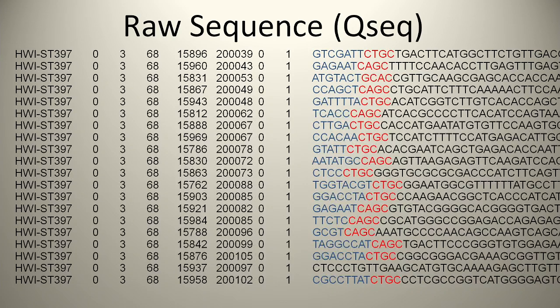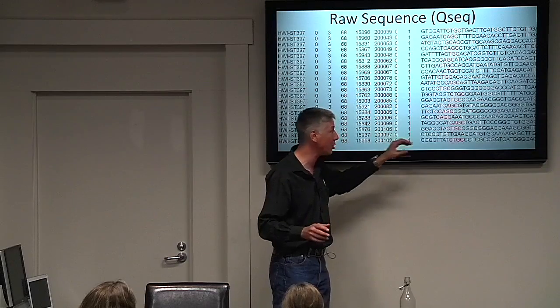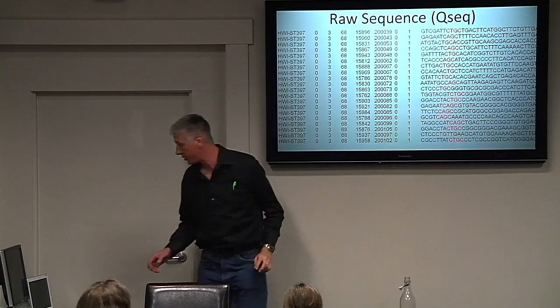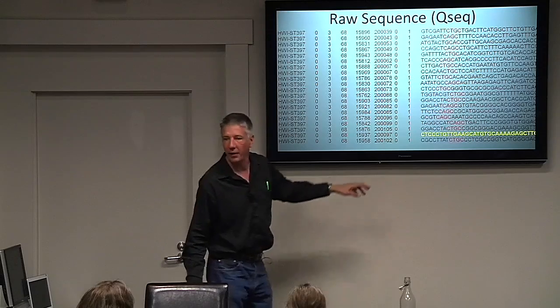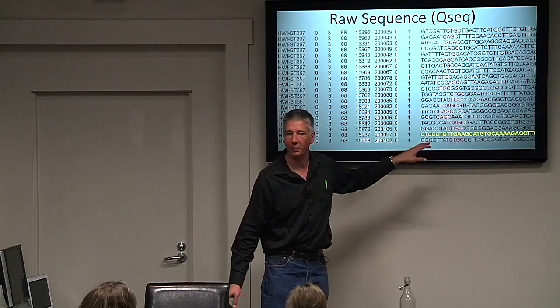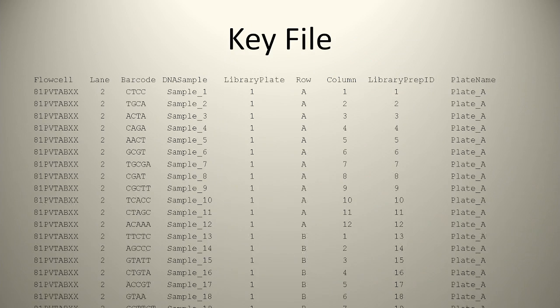And so you see in red, those are the restriction cut sites, right? Okay. And before those, there's some other letters. Those are the barcodes. So when you open up a sequence file and you look at it with its GBS data, right? Not if it's just random sequence data, but if it's GBS data, you should see some patterns kind of like this. Now, not everything shows the right pattern, so we've got some things that don't come through quite perfectly. And that's true with any system. So just to highlight that that happens.